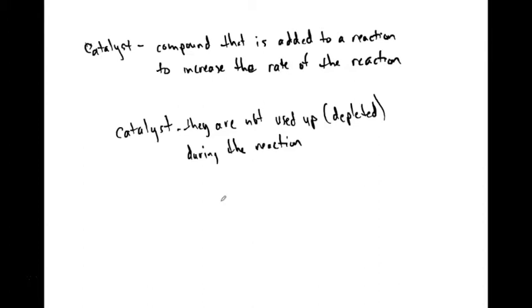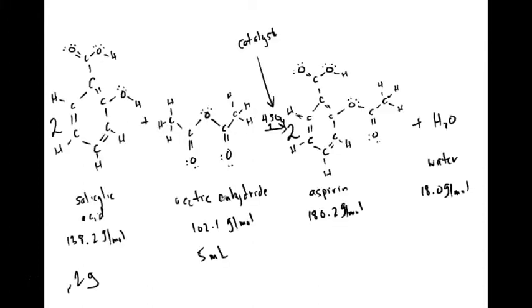So that's about it in this reaction. We're going to set up in a beaker, a flask with our salicylic acid. We're going to add our acetic anhydride, slowly add the acetic anhydride, add 5 drops of sulfuric acid. We're going to slightly heat the system to get to products.